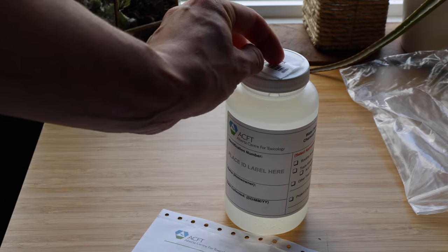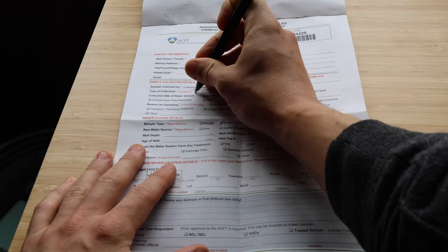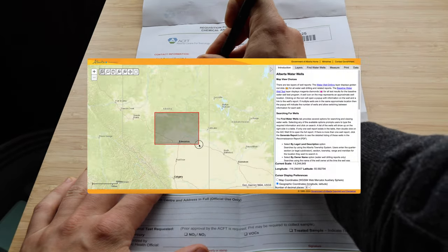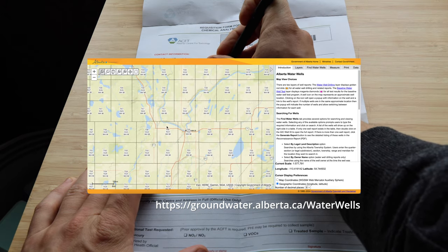I'm nearly done and just have to fill out a requisition form before I drop the sample off for lab analysis. I need to know the ID of my well and some other related information. Fortunately, I can easily access this information through the Alberta Well Information Database.